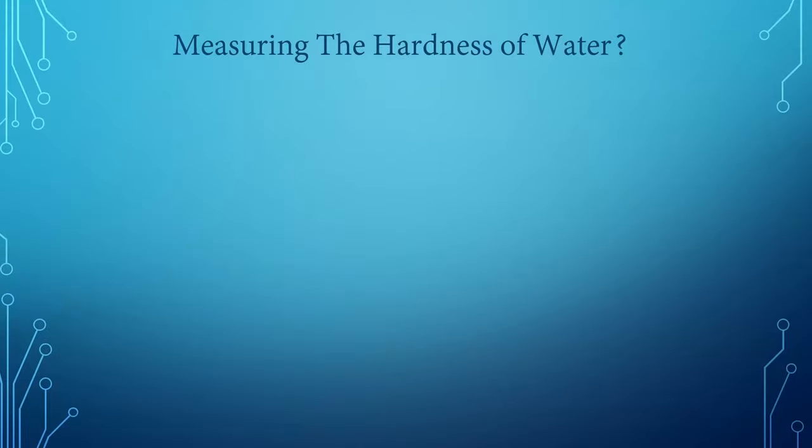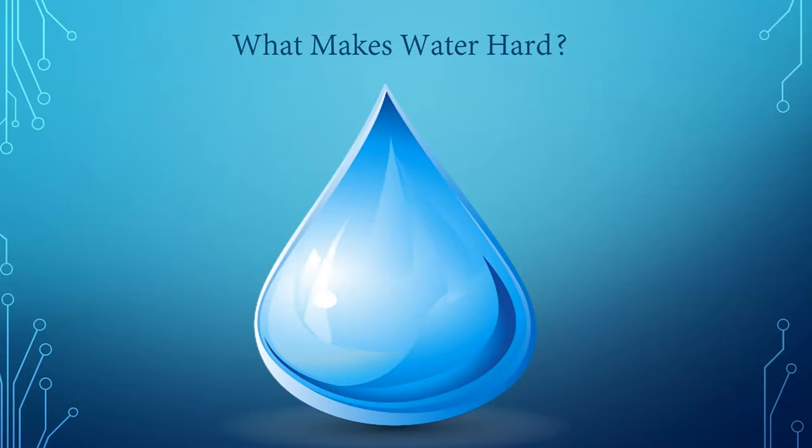As I mentioned in the introduction, our goal today is to measure the hardness in a sample of water. So what exactly makes water hard? It doesn't feel hard. It's not like concrete or something. Hardness is a measure of minerals or metals that are present in the water. There's a lot of different elements present in tap water. Tap water is not pure. For example, there's always calcium in water, and calcium is the main thing that causes water hardness. When we measure the hardness of water, we're normally measuring the amount of calcium in a sample of water.